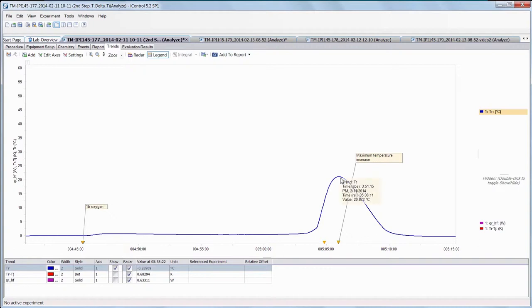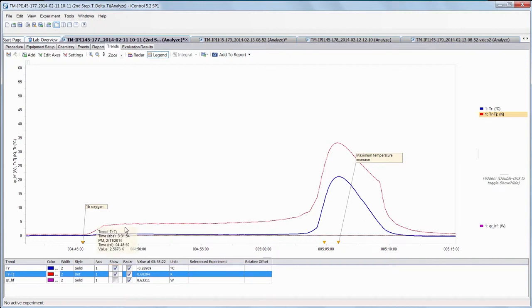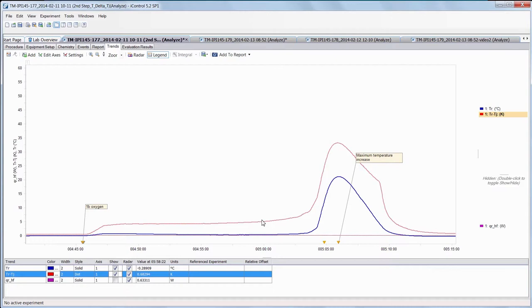What you may not be able to see is the fact that upon introduction of oxygen, you actually have a pretty significant Tr minus Tj difference. That's what I'm plotting right now in a dotted red line. You can see that you go up to about three, four degrees, that's not huge but that's significant, it's a decent amount of energy.